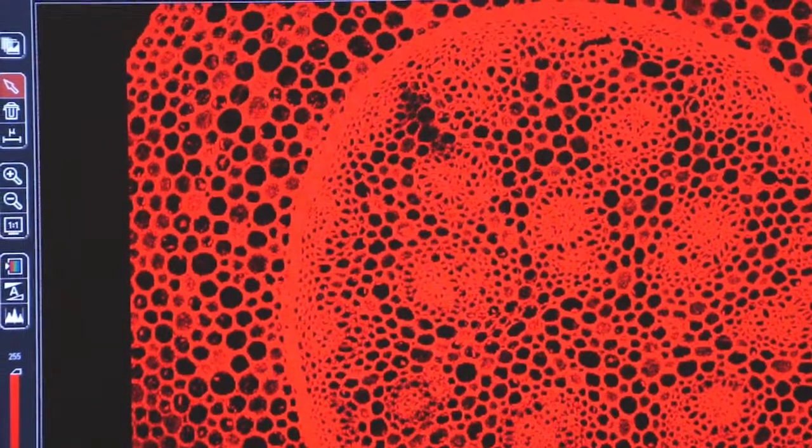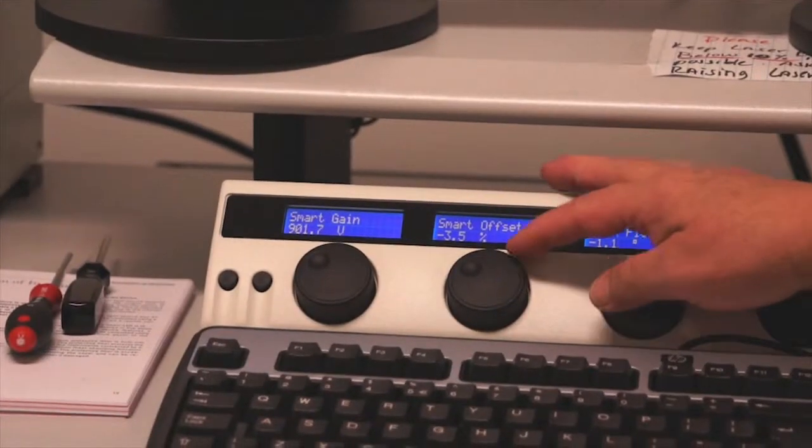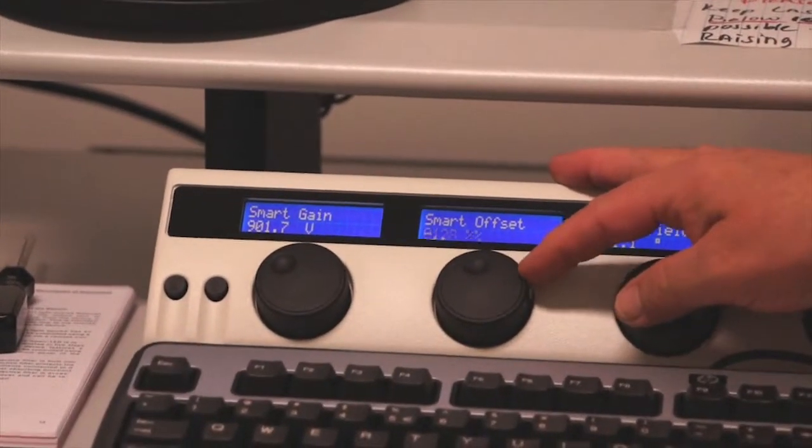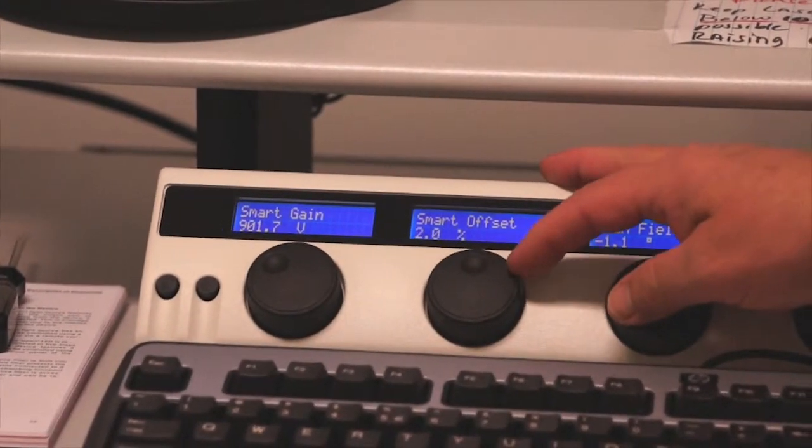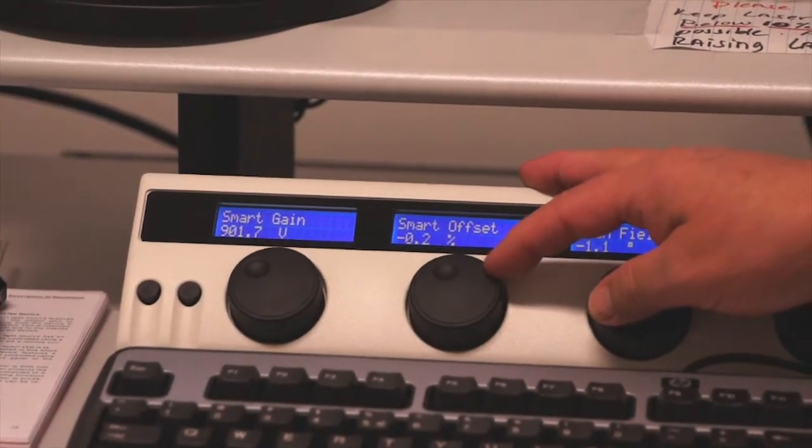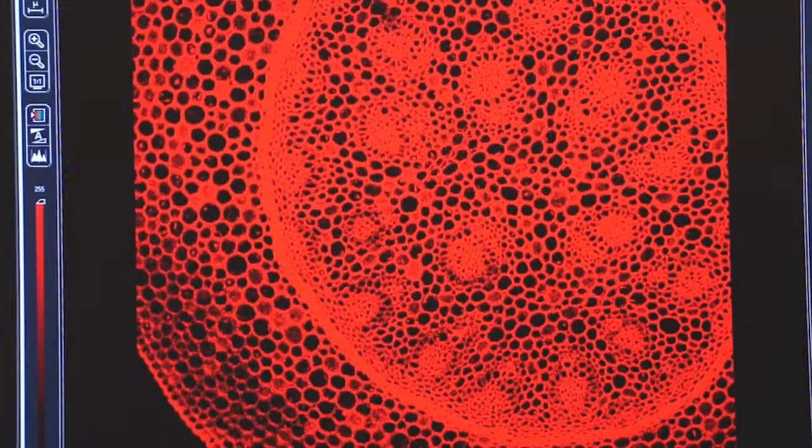The other tool that's important on the toolbar in getting a good image is the smart offset. The offset should always be a negative number. Usually minus 2, minus 3, somewhere in that range.